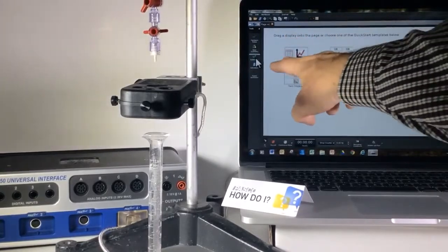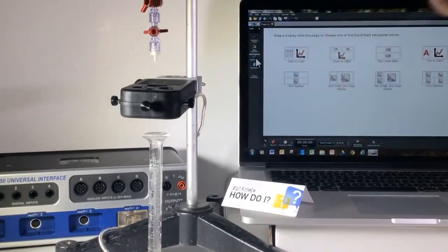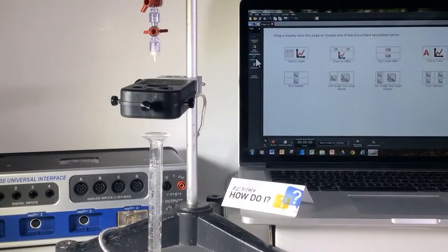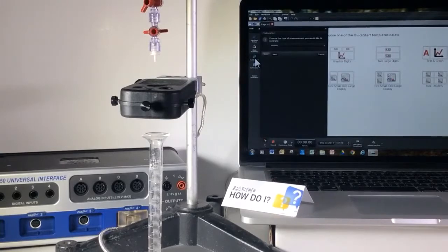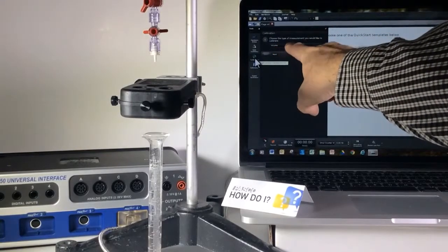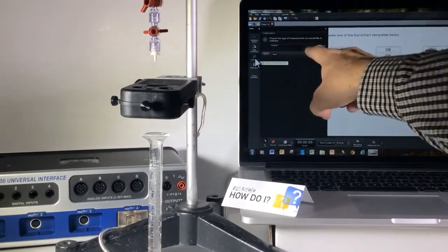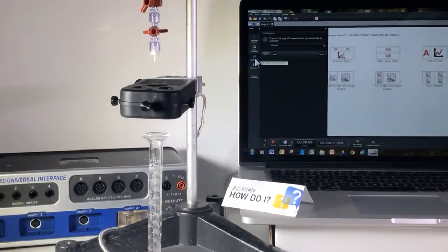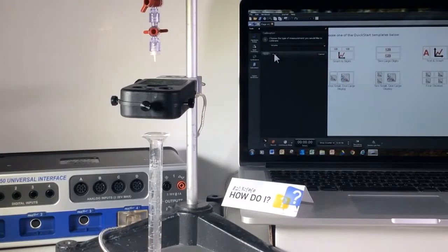In capstone on the left hand side, I see the green calibration button. I'm going to click on that and it instantly knows that I want to do volume. So I'm going to say next.